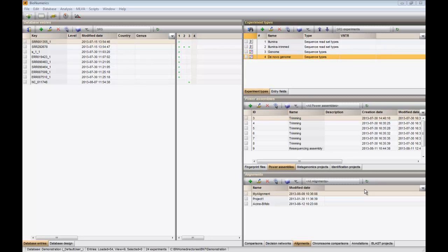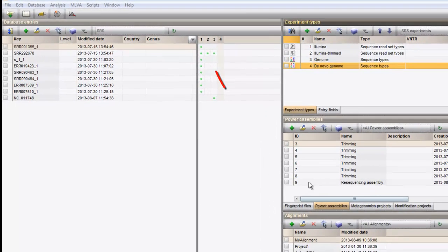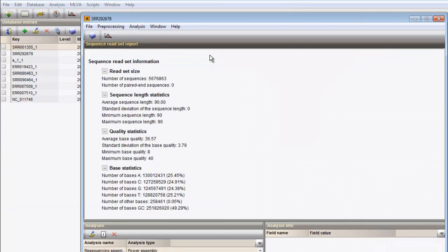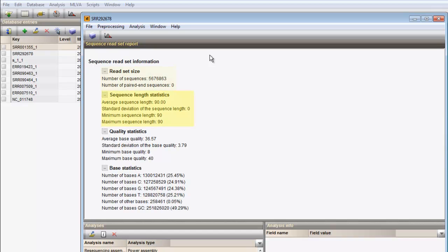We can open the experiment card for the data by clicking the experiment dot. From the Sequence Read Set report, some basic summary statistics on the reads are displayed, including information on read set size, sequence length statistics, quality statistics, and individual base statistics.